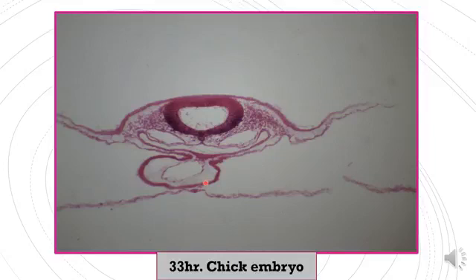You can see this is the epimyocardial mantle. You can see the epimyocardial mantle is continuous with the visceral lateral plate of the mesoderm, because it is derived from the visceral lateral plate of the mesoderm.